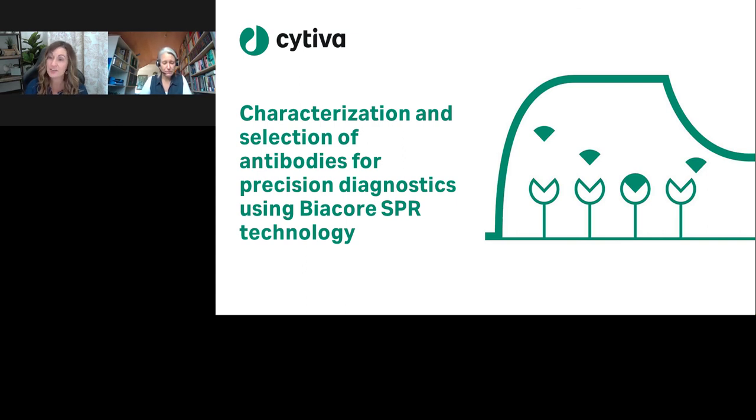Great. And Anja, let's wrap with this question. Isn't there a risk of clogging of this microfluidic system when working with crude sample extracts or plasma?